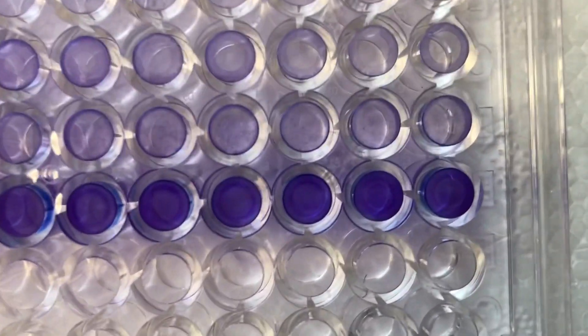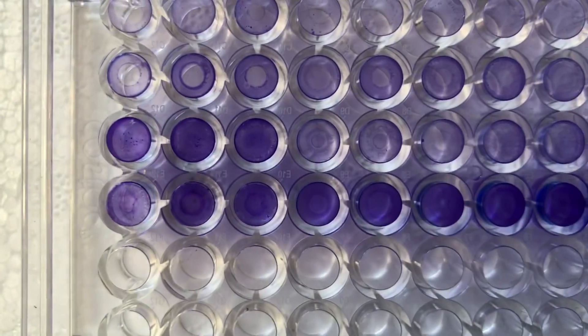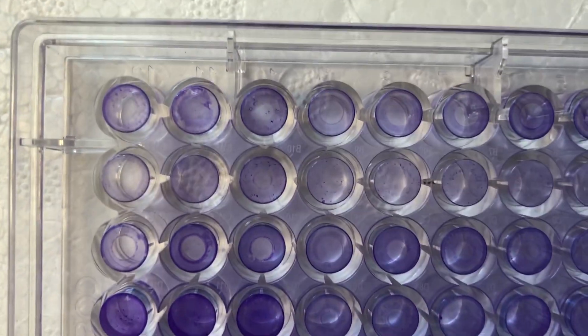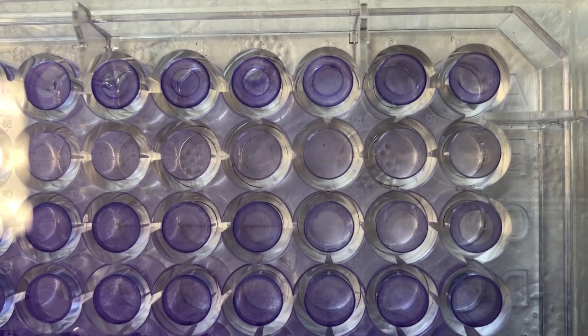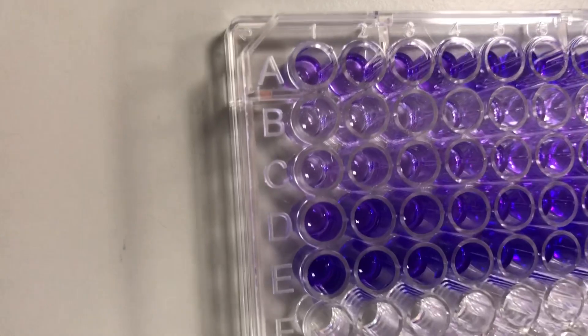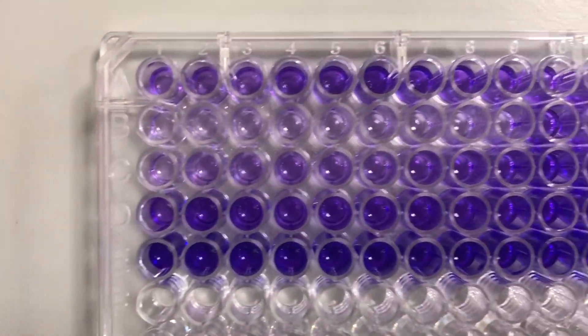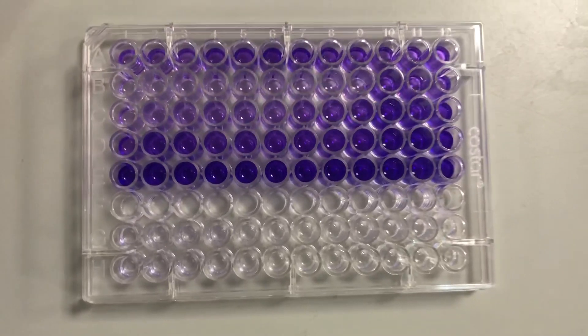Here is how my plate turned out. Honestly, I am so happy with this. The different intensities in the colour of the purple is because each row is a different bacteria and they all grow different amounts of biofilm. And this is what my plate looks like once I add 70% ethanol to suspend the dye and the bacterial cells. Don't you just love the purple colour? It's honestly my favourite.